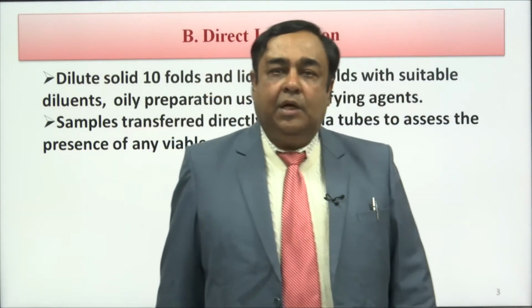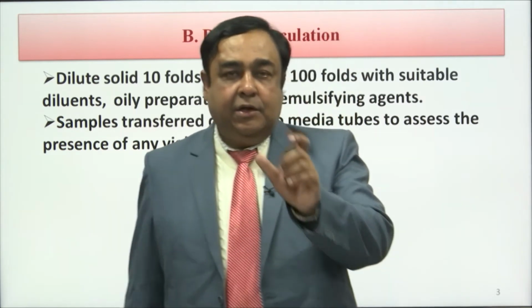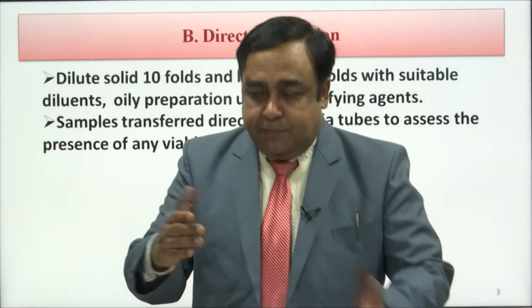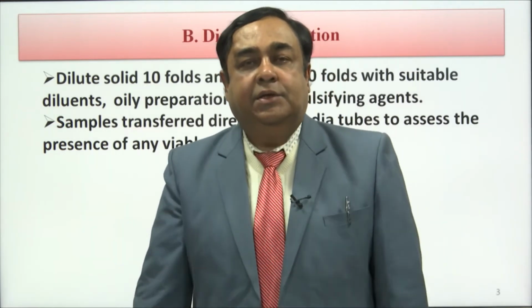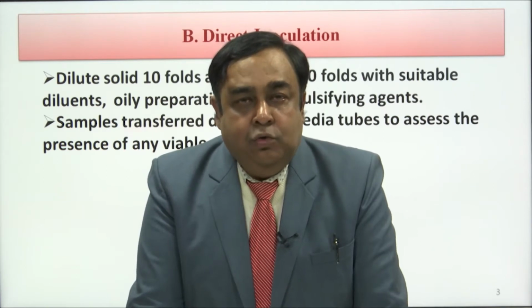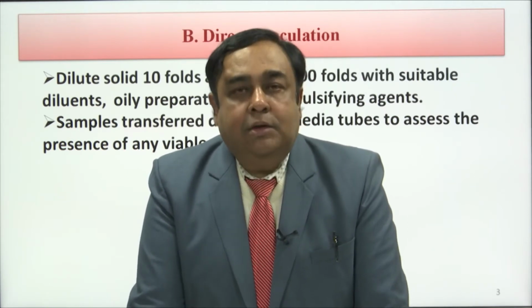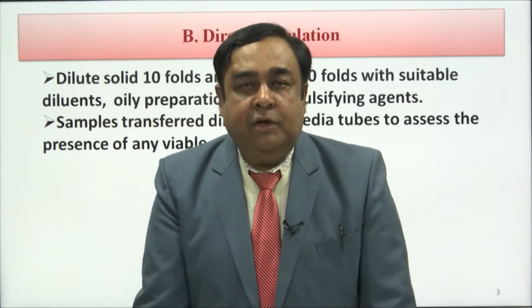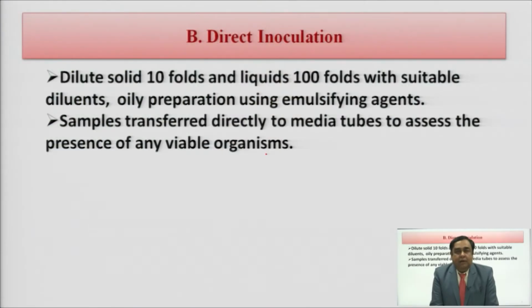Now, the term direct inoculation. Let me quickly recapitulate that sterility testing is basically done by two methods. One was the membrane filtration technique, and the second was the direct inoculation technique.